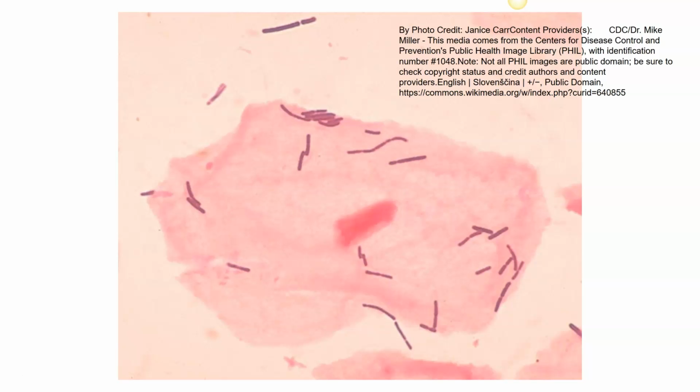When we look at bacteria and where we find them, this is a cell. I believe this is a cheek cell. You can see bacteria growing in around the cell, the eukaryotic cell. You can see the comparison of the size of the elongate bacilli, the cell in here with the nucleus on the inside. When we look at bacteria, they're very tiny compared to regular type eukaryotic cells.